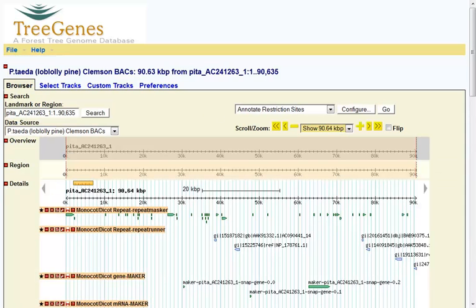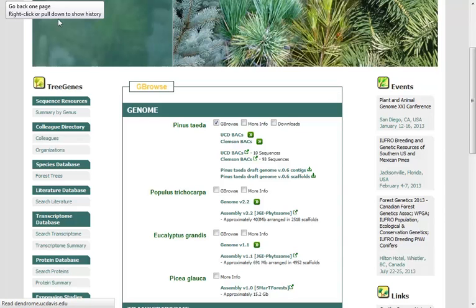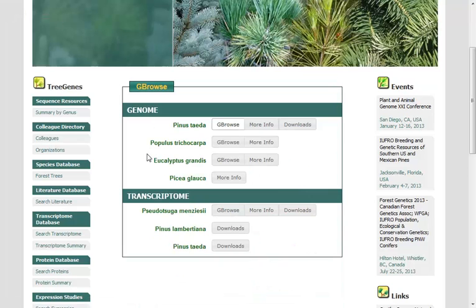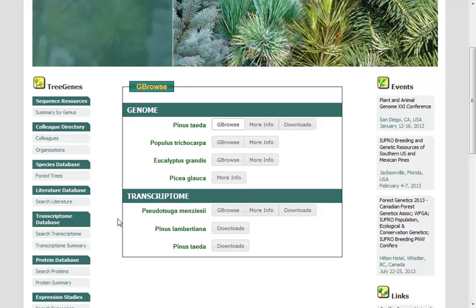Let me just go back to the main site again. Here again you could go to other species and sometimes you can go to different groups that are doing different assemblies on these. There's other types of data that you might be interested in as well. You might be interested in the transcriptome data.